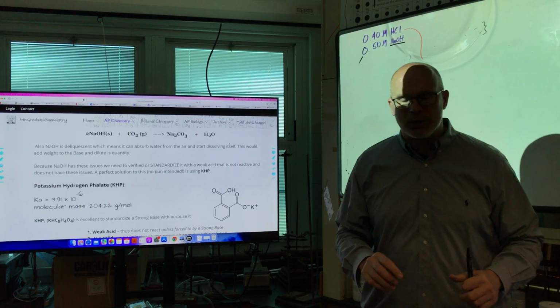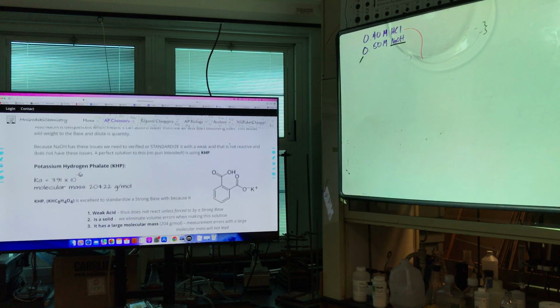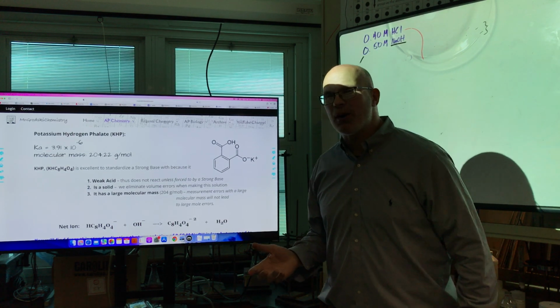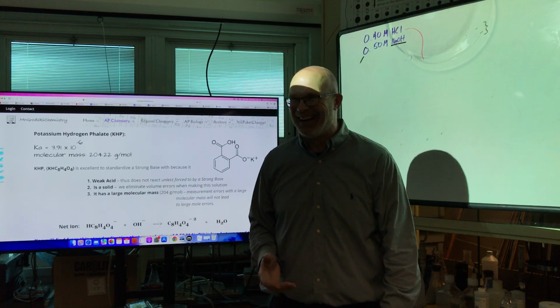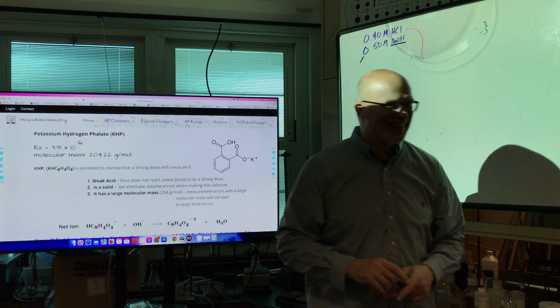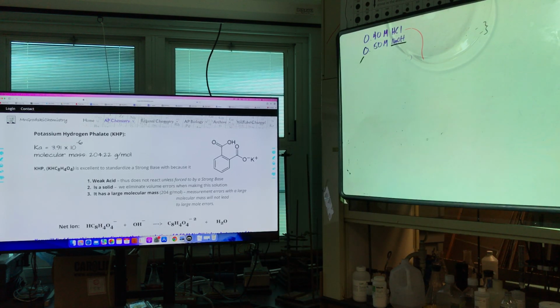We're going to use something called KHP. Say it with me. KHP. I didn't hear anything. Say it with me. You've got to say it with me. Okay, too much fun. Oh well, it has to end sometime.